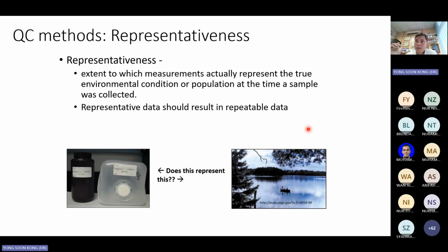Puan Use, because other students might use it for their final year project, so you have to be very early and very quick. As early as possible, book with her how many sample bottles that you need so that you can answer and meet this requirement, the QC requirement, representativeness. Okay, now that is for your field trip.